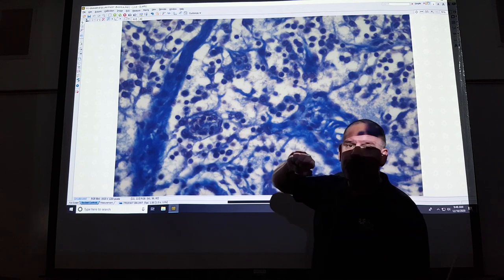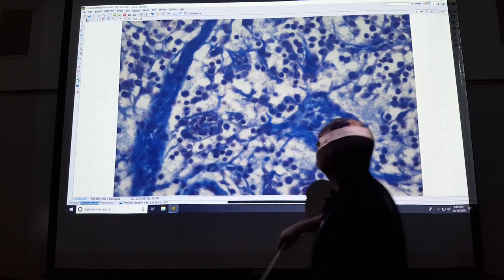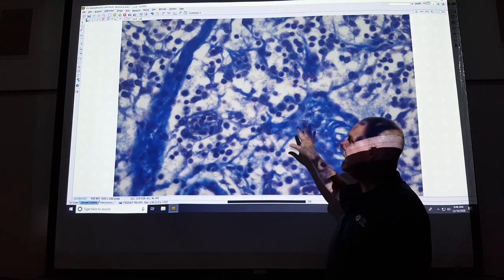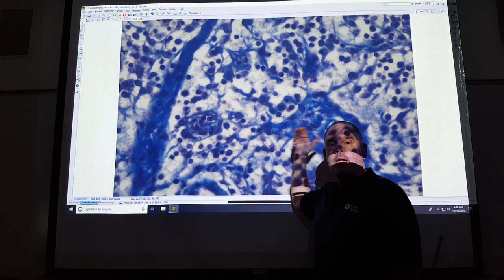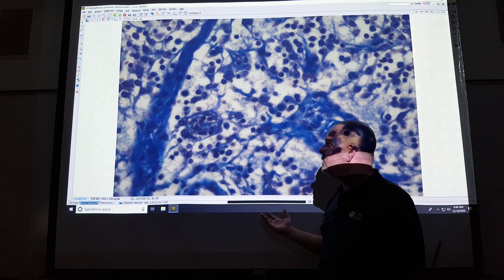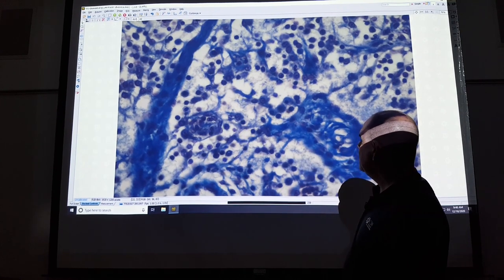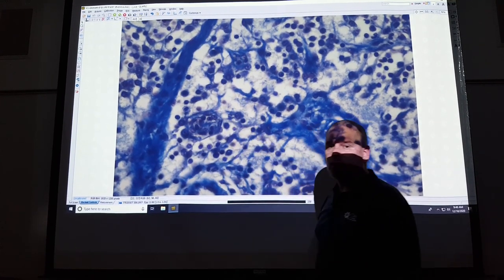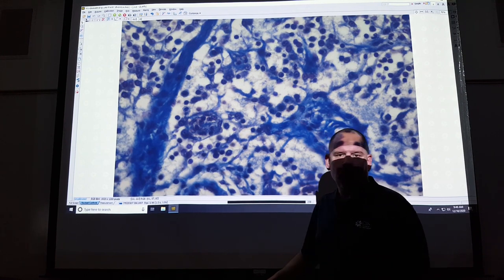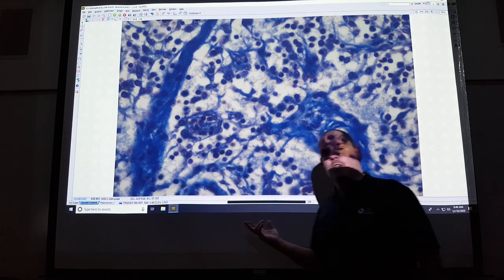And what I can see, if you look closely, go ahead and pause me, are these very small fibers, essentially small versions of collagen, which are reticular fibers, making up this tissue. This happens to be a micrograph of a lymph node, which is one of your locations for this particular connective tissue. You can often see these little bundles of reticular fibers like you see here, as well as individual reticular fibers, oftentimes stained some sort of bluish, violet, or purple color, which seems to be the most common staining pattern for this particular tissue. So name the tissue: reticular connective tissue.